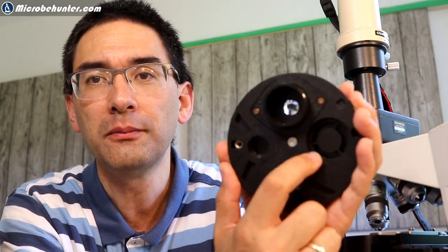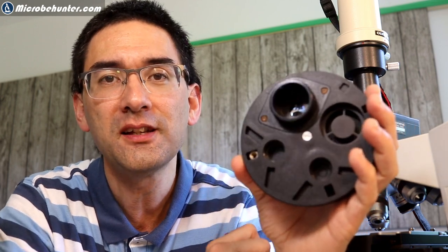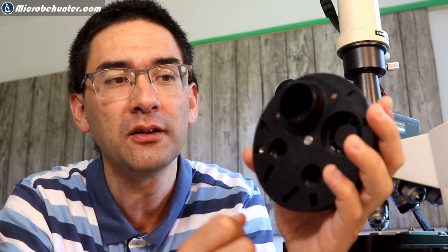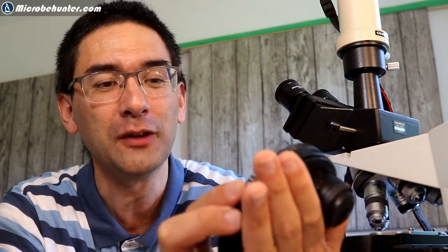I have a dark field patch stop here and I've got two phase annuli. So these two things here are for the 10 times and the 40 times phase contrast objective. Right now I only have the 10 times. I'm still waiting for the 40 times phase contrast objective to arrive.